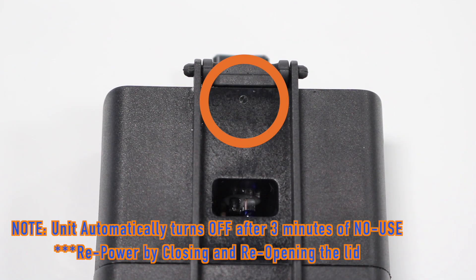Please note that the module will automatically turn off after three minutes of no use to conserve battery life. To repower, simply close and reopen the lid.